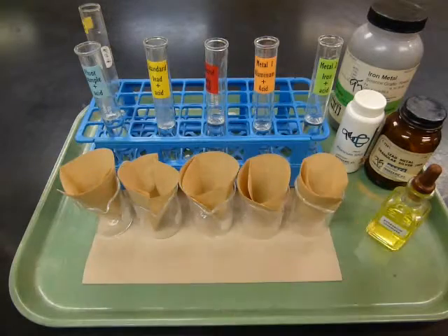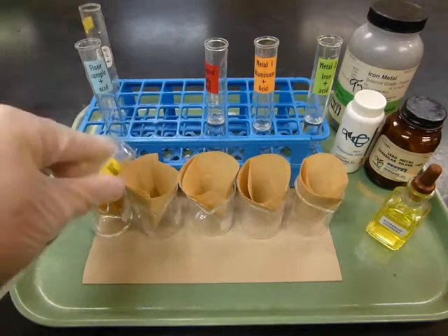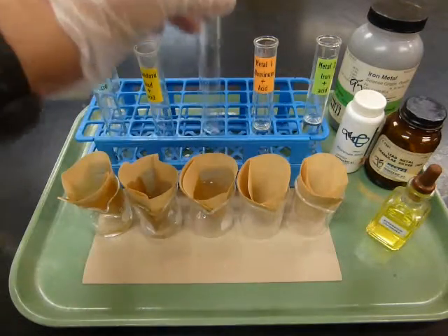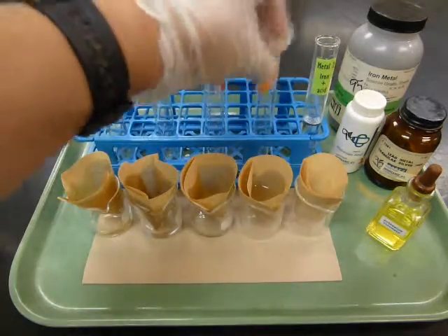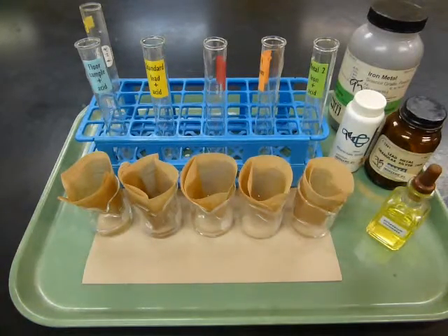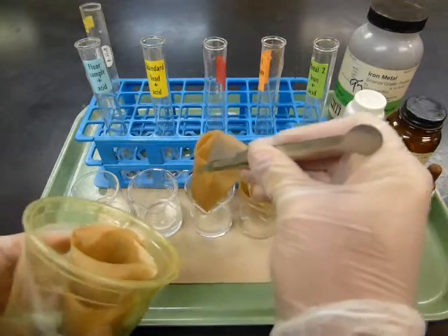I boiled the samples in acid like we did, and I'll pour them through the filters, and instead of cups I'll use beakers so that you can see what they look like when I add the chromate. Now what we're looking for is evidence that the results that were obtained indicate that there's lead in the sample that came from the floor. We want to rule out any alternative explanations for what we observe. So let me take out the filters here, and then I'll add the chromate, and we'll see if there's a reaction or not.